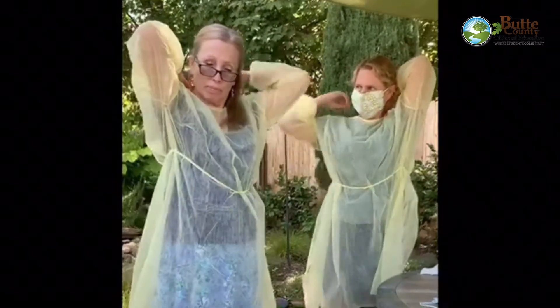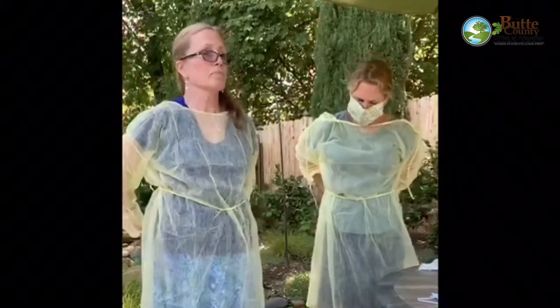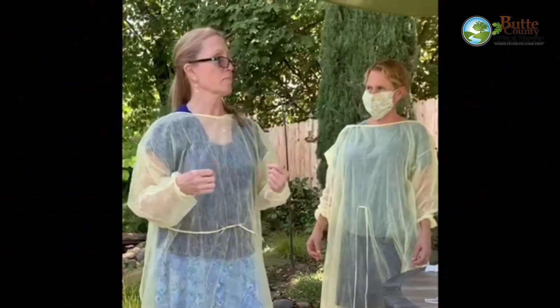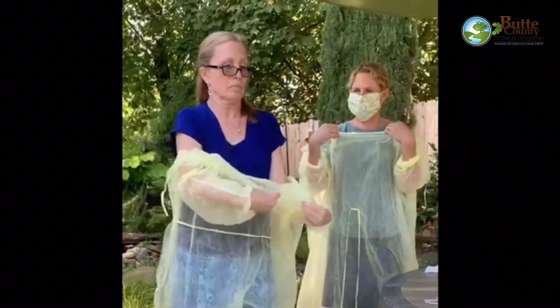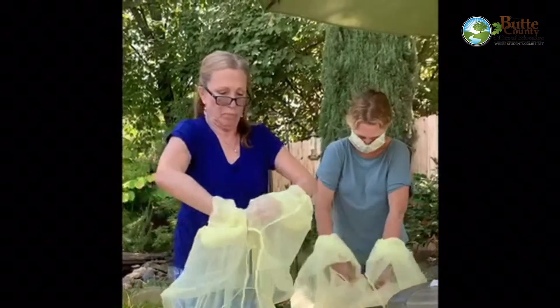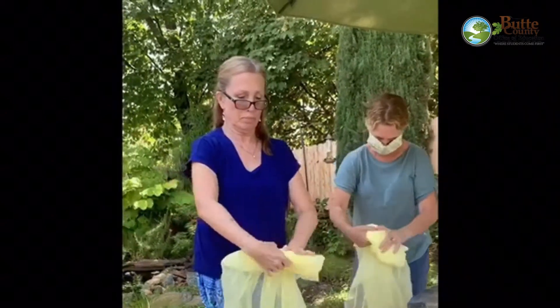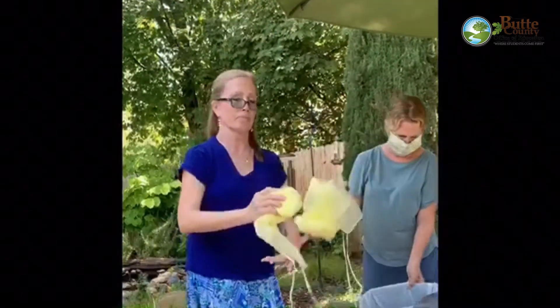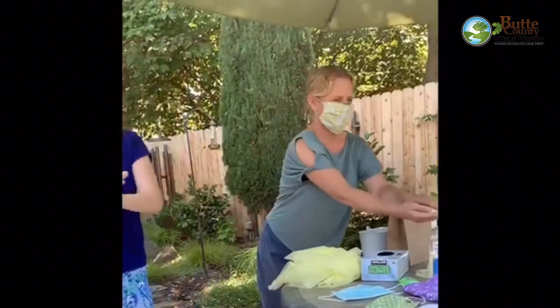To remove the gown: one, untie all ties or unsnap all snaps. Two, some gown ties can be broken rather than untied. In that instance, break the ties gently, avoiding a forceful movement. Three, reach up to the shoulders and carefully pull or roll the gown down and away from the body, so that the inside of the gown is the only area that you touch. Four, dispose of the used gown. Five, wash hands and wrists with soap and water for 20 seconds or use an alcohol-based hand sanitizer.